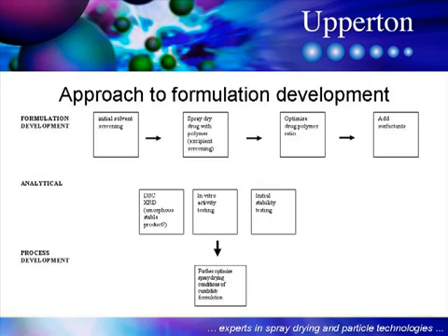At the same time that we produce these test formulations, it's also important to do a number of physical tests to ensure that the spray dry dispersion is both amorphous, stable, and also that it has good dissolution properties. So for example, we use a number of physical tests such as DSC and XRD to ensure that the spray dry dispersion is completely amorphous with no crystalline contents.